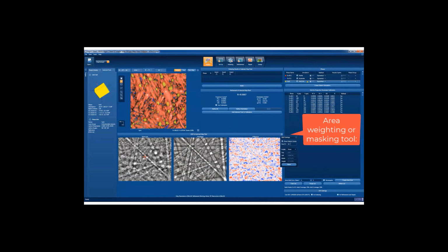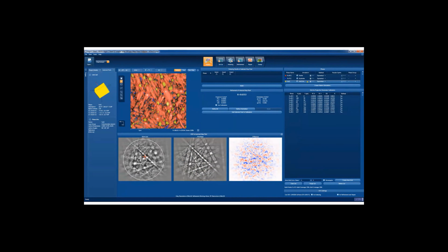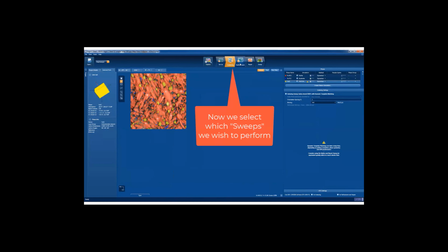And we've loaded in the simulations already. We didn't go through actually generating the simulations, but we've done a calibration. So for this actual map data set, we determine the exact projection parameters. We fine tune where the pattern center is, what the insertion distance of the camera is, and effectively identify what distortion we're going to get.